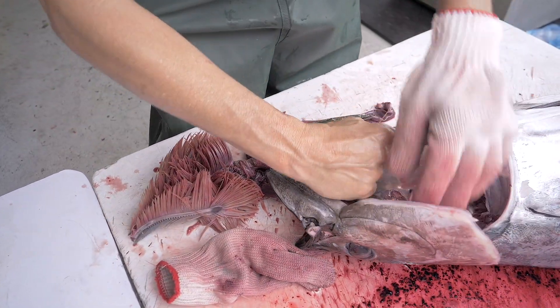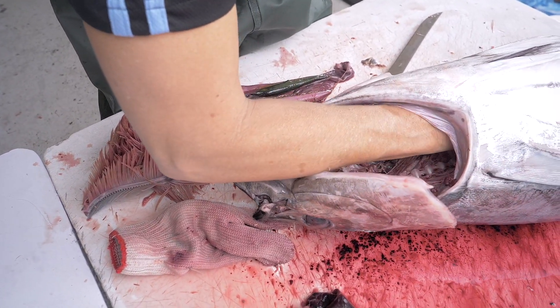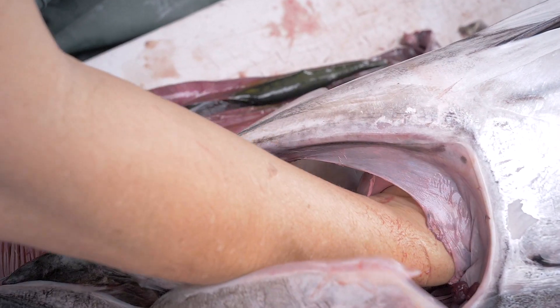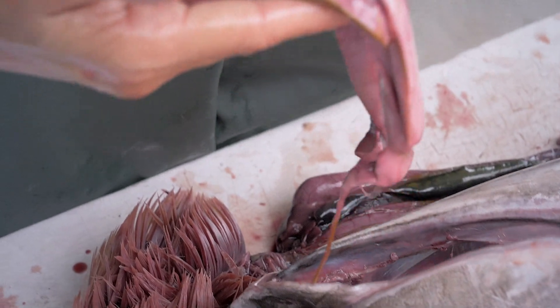If the gonads are still inside the fish, you just need to slide your hand inside the fish and feel the skin against the backbone — you will find the gonads. Pull them very gently, being careful not to break them.